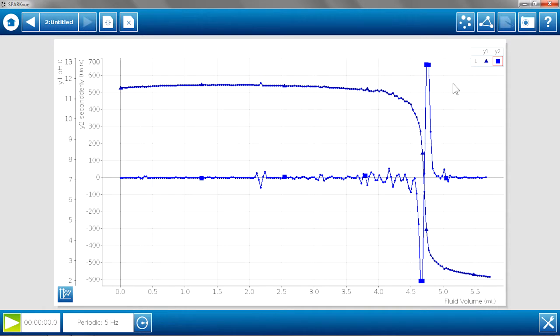The pH's equivalence point should be right around 7, because it was a strong acid, strong base. And the second derivative shows that by showing you where the plot crosses the 0. So we see a nice indication of the equivalence point using that second derivative.